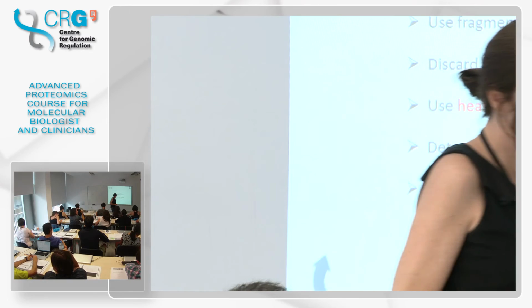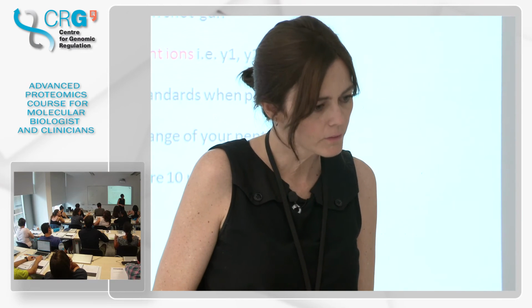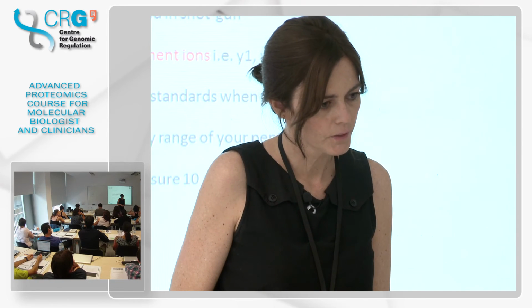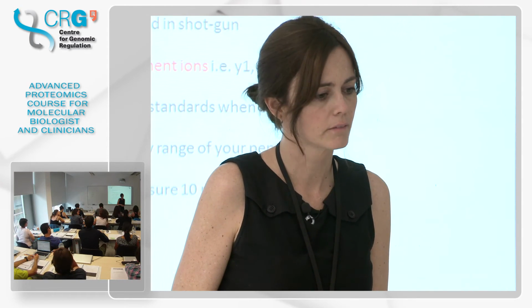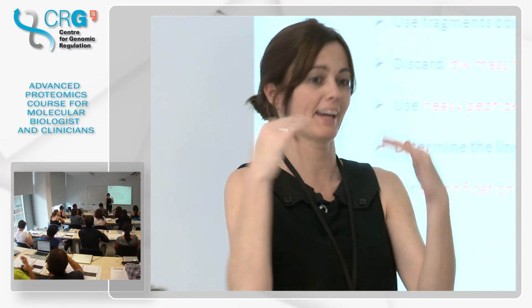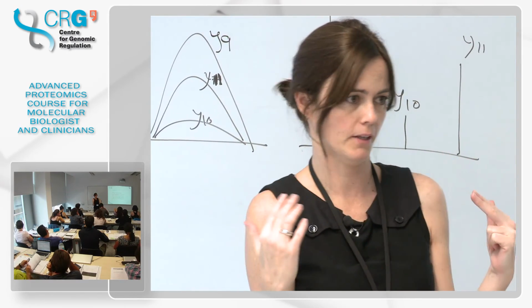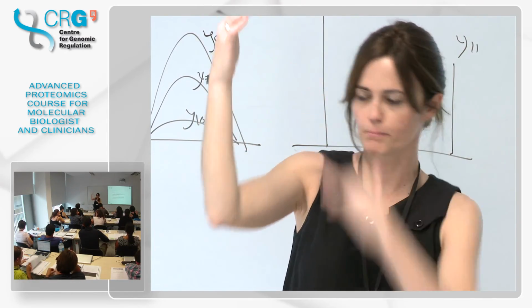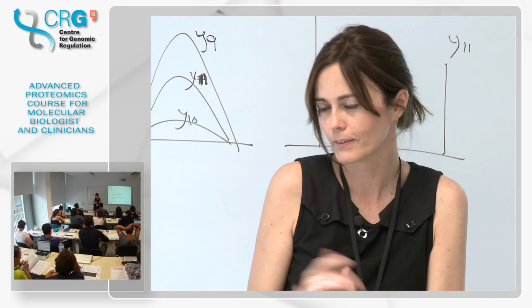Sorry, the correlation between the heavy peptide as compared with the traditional peptide is done by the intensity? Yes. Knowing the intensity, you correlate. If you have, for example, 3 parts out of 1, you divide. It's a ratio. And ideally, to be more accurate, the closer the ratio is to 1, the better. Because if you have one signal 100,000 times bigger than the other, the ratios are not going to be as accurate. But you do what you can.